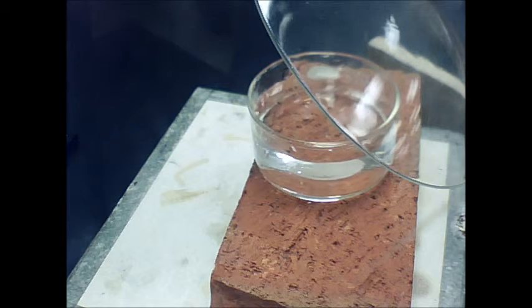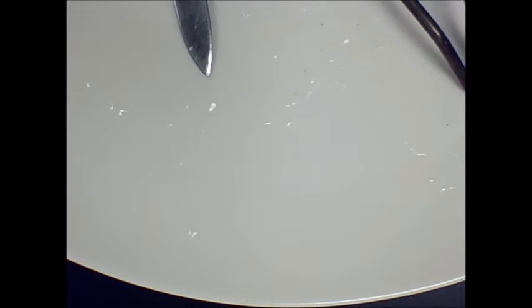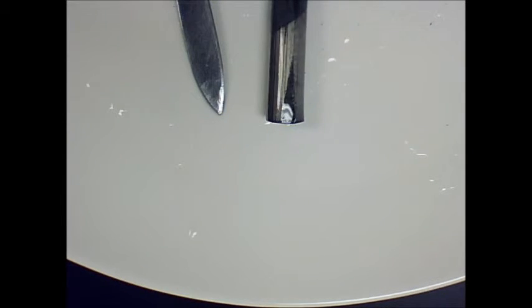The last one I have to work with here is lithium. There's some lithium. And we're going to cut this a little bit just to see this. You can kind of see where it's shiny there.